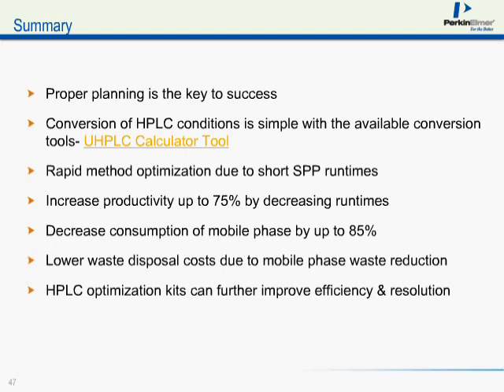Next question I had was concerning the low volume flow cell. The question is that to optimize your system, you have to use a lower volume flow cell, and it has a shorter path length. Wouldn't that decrease your limit of quantitation or your sensitivity of your system?